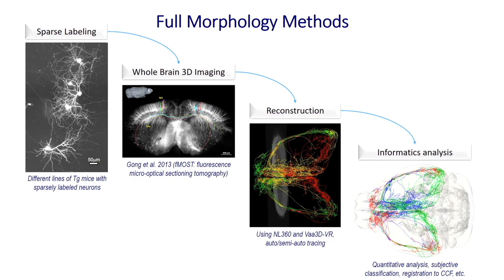Then we use the big data to do the single cell reconstruction at the whole brain level. Initially, we used Neurolucida 360. Recently, we changed to a more advanced 3D VR. Also, we have auto-tracing algorithms in progress. And subsequently, various bioinformatics analysis will be performed.